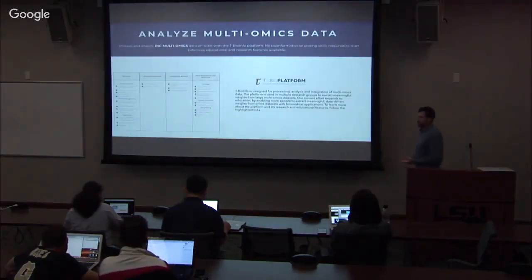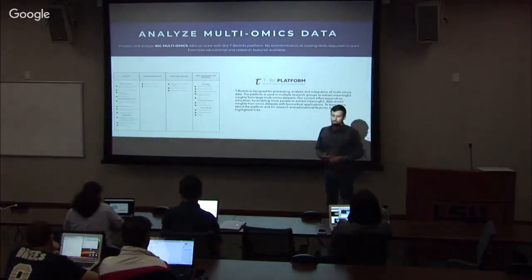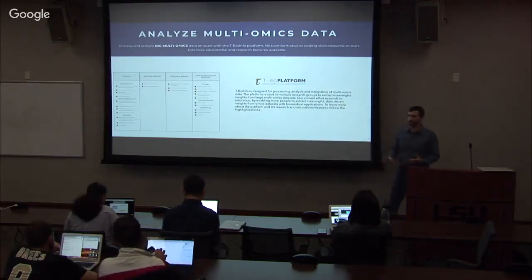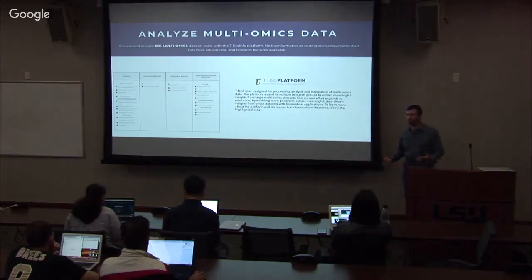As you remember, in the previous session, when we did an introduction to this course, we talked about different types of omics data. We specifically talked about how processing and analysis of this data is going to be the focus of the sessions. Different methods for processing the data were created at different labs or universities with different coding languages, so it's an assembly of different methods.